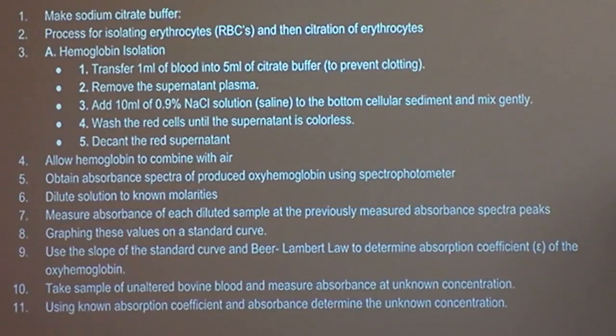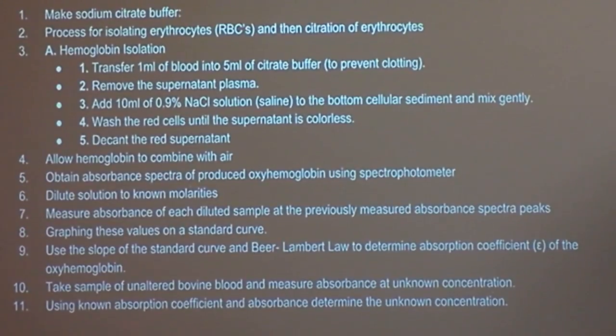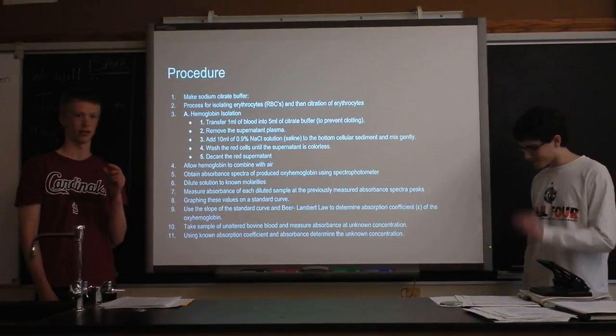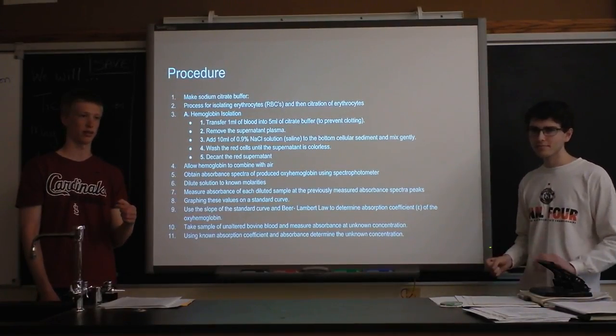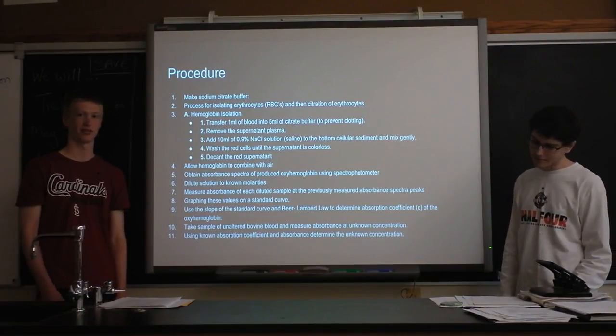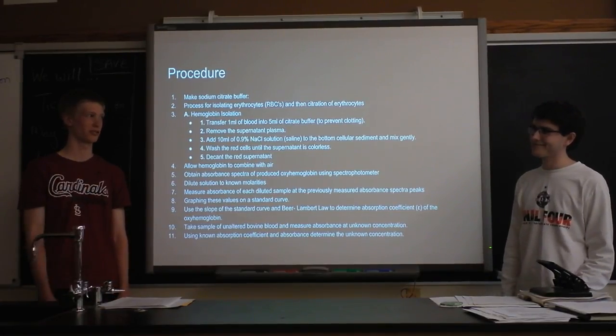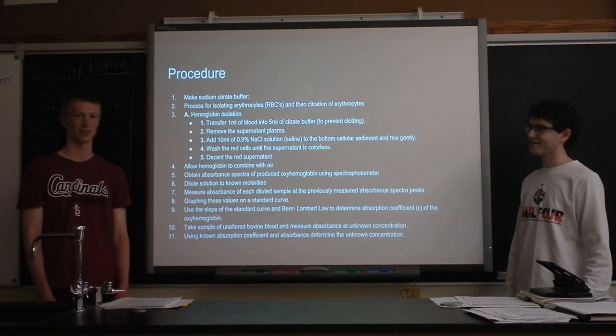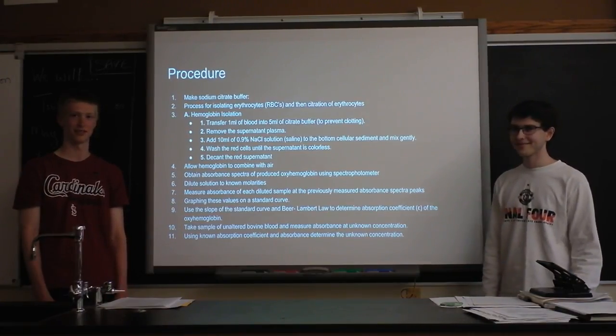And we had to use a centrifuge, which spun the blood around really quickly, so it separated into the plasma, and then the red blood cells would be at the bottom. The centrifuge we found in the chemistry storage room was ancient, and we had no idea how fast it was actually spinning, so that was kind of interesting.